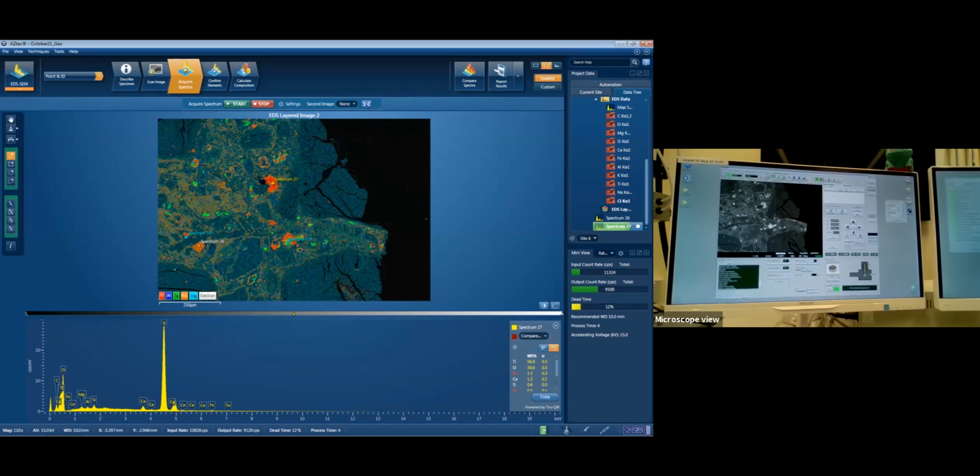So what we could see was titanium rich on the map is definitely titanium. It is rutile again by the looks of it. So we've got this iron rich one down here. There's an iron oxide with a little bit of titanium in it, which isn't a surprise because it's got that big band of titanium around the edge of it. So there's probably a little bit in the middle too.